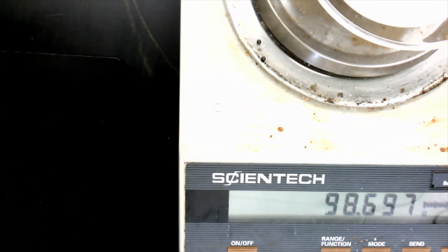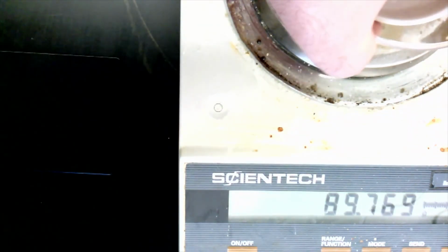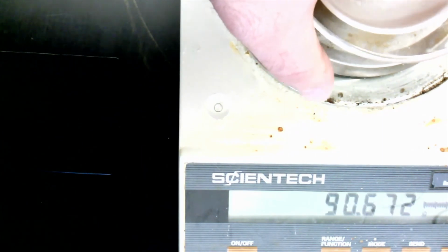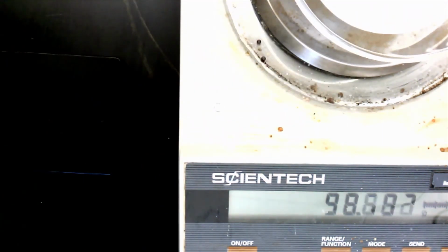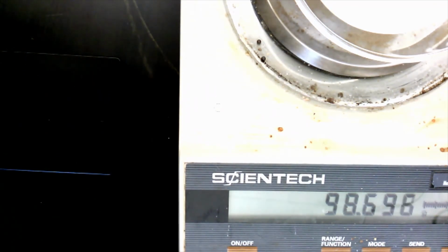Give it a minute. This balance in particular can have a little bit of fluctuation to it, but it was the only one that I could unplug and move over here. Okay, 98.689 grams is what we're going to go with. That's what it's stabilized at a couple of times.